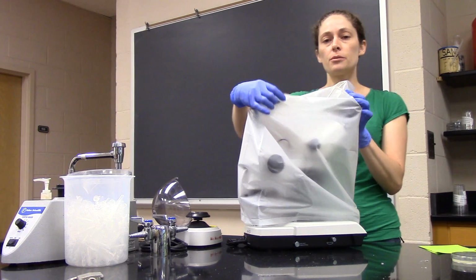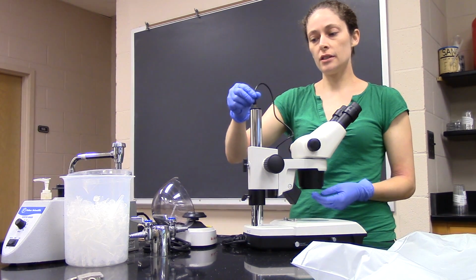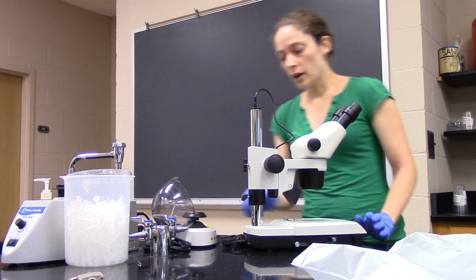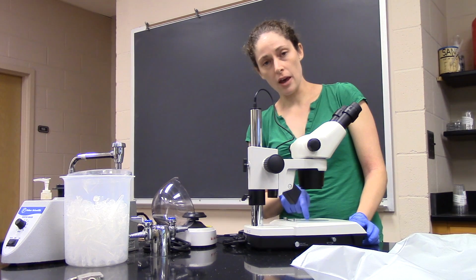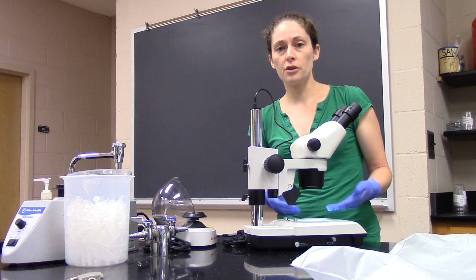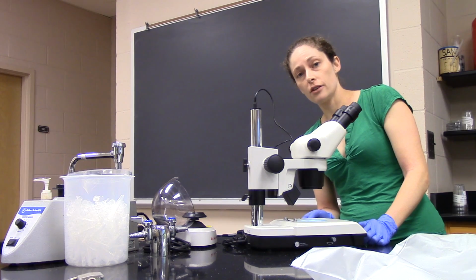Okay, so place it somewhere comfortable, take the protective cover off, and then plug it in. And you might have to plug this extra wire in that sticks up on top. Okay, now to turn the microscope on, you'll want to flip this switch in the back for the main power source. And then there are two switches over on this side that control the top and the bottom lights. You can switch them both on. And then as you work with your sample, you can decide if you want both on or just one on, etc. And they each also have a dial on the side here that adjusts the strength of their light.